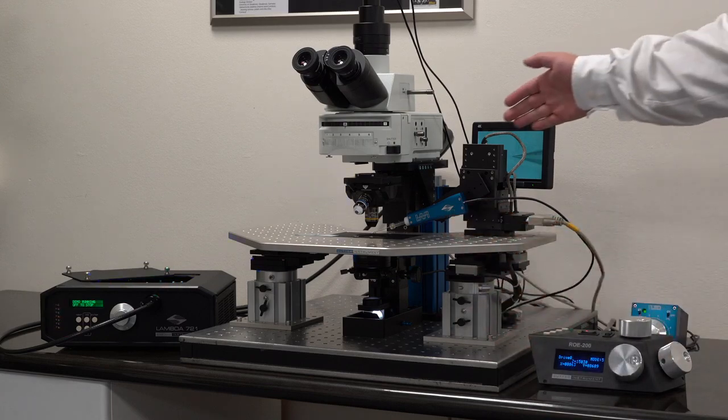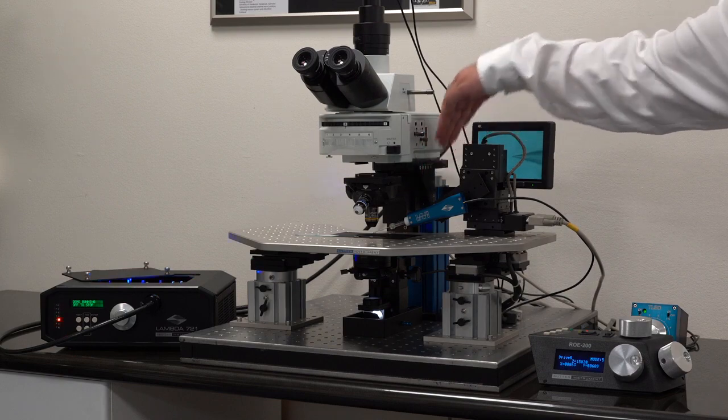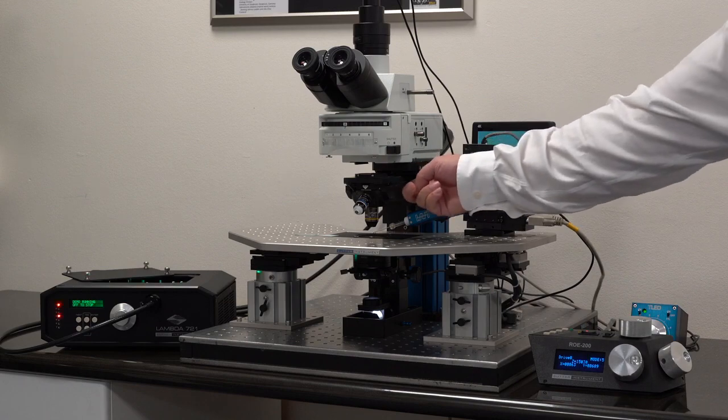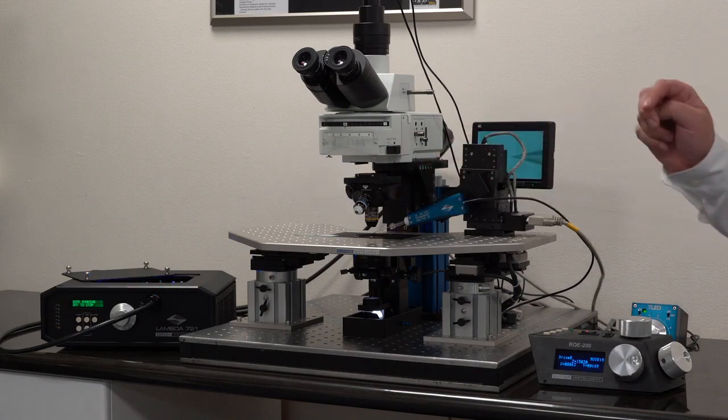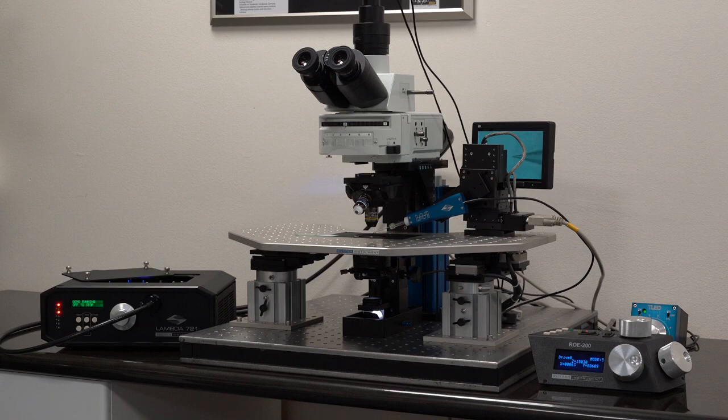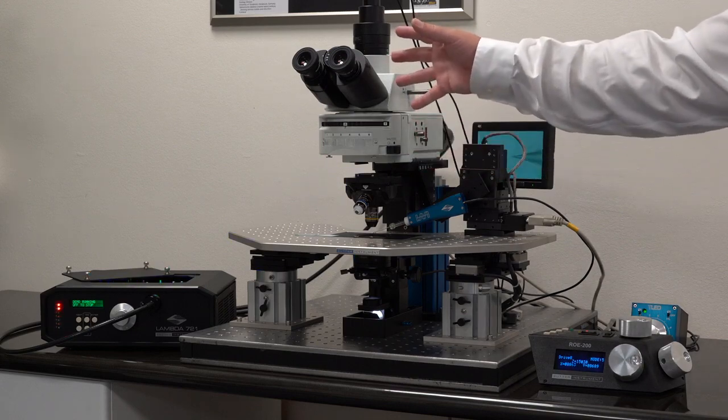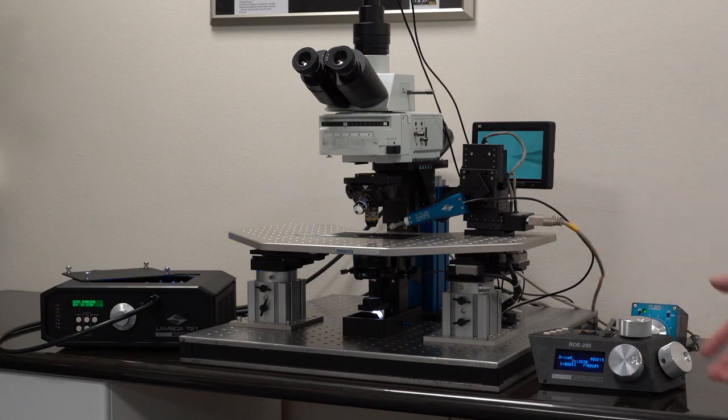Within the core of the NAN we have a 25mm Z-axis for the focusing. In this case we're using an Olympus swinging nose piece and focusing arm. This microscope also has a BX2 epiluminator and trinoc and generally all Olympus optics.